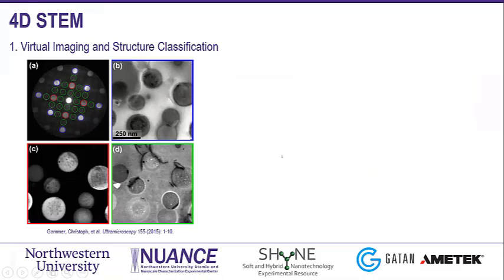Now, a few examples for 4D STEM, as I can show in the beginning, of what you can get from these large data sets. So the first example, and the most simple thing to do, in my opinion, would be virtual imaging and structure classification. Here is a nice example of a metal alloy, with the references at the bottom.